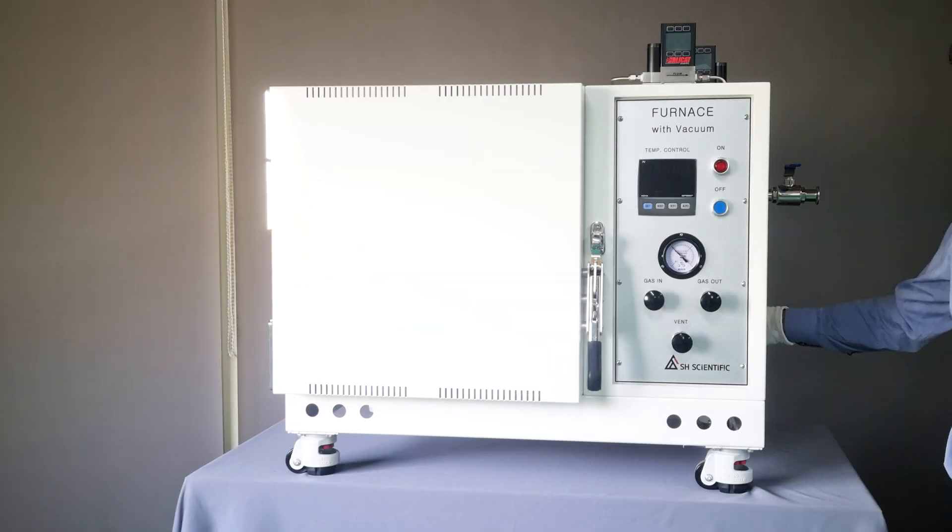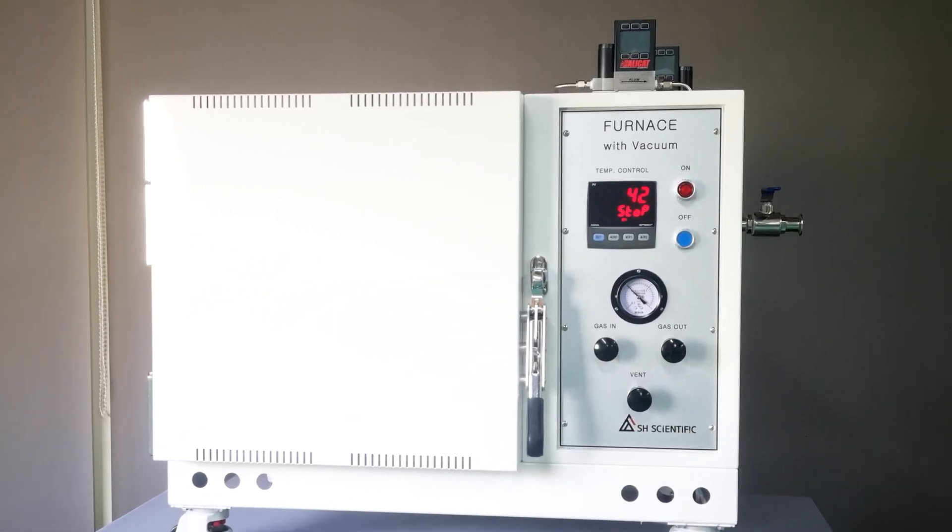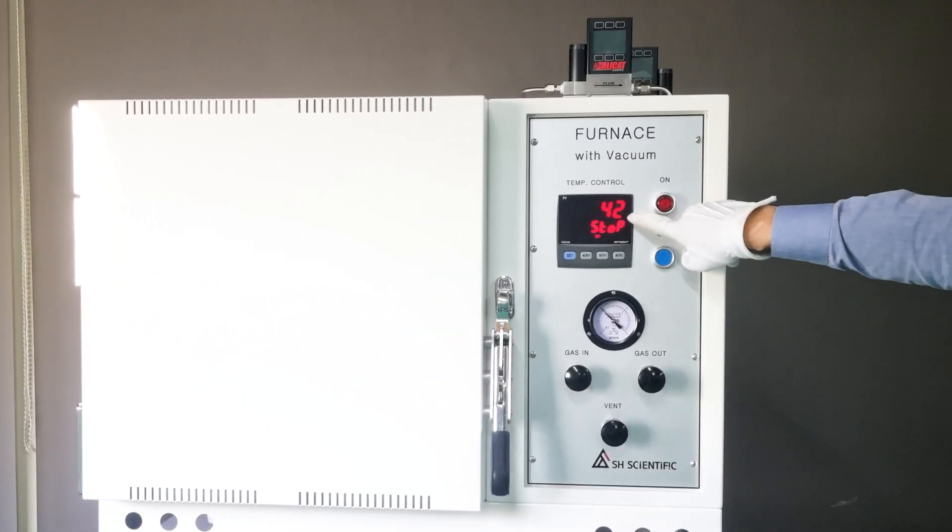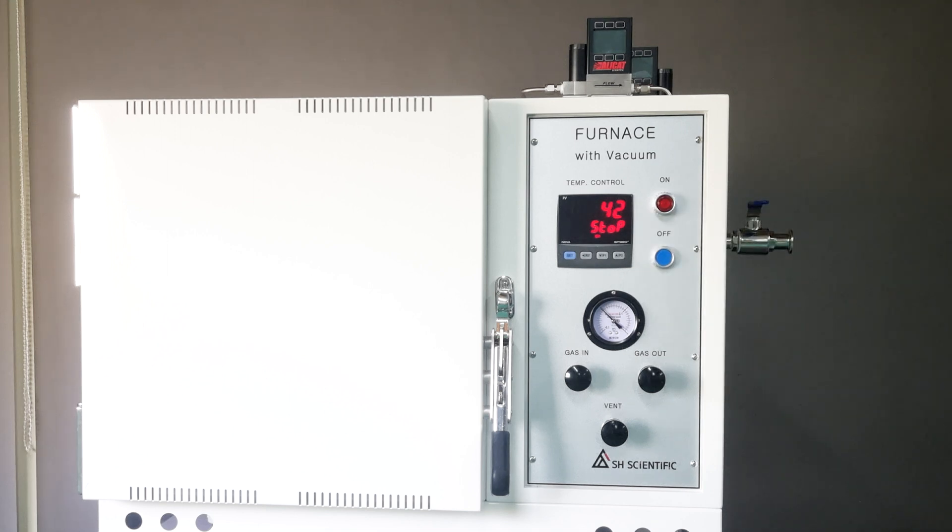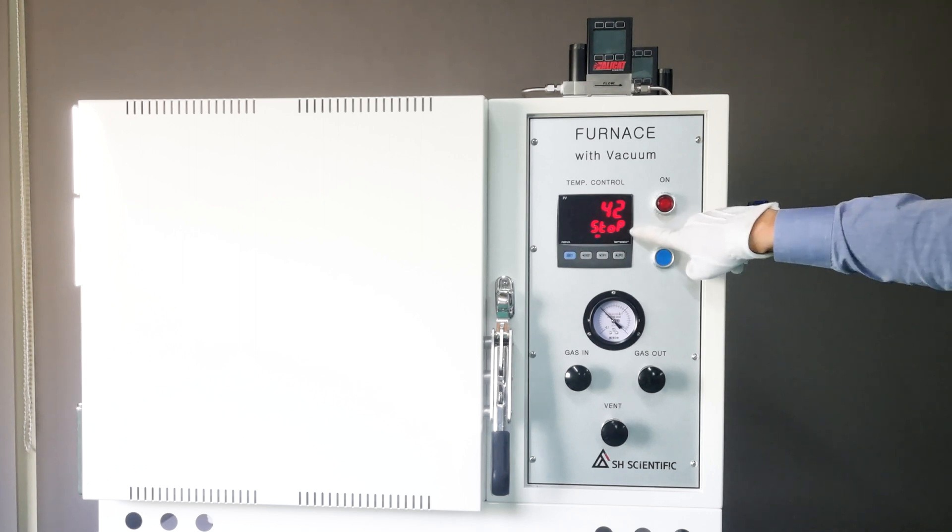First, turn on the main switch. The upper window shows the current temperature inside the chamber, and the lower window shows the operation status. Right now, the furnace is not in operation, so you see stop.